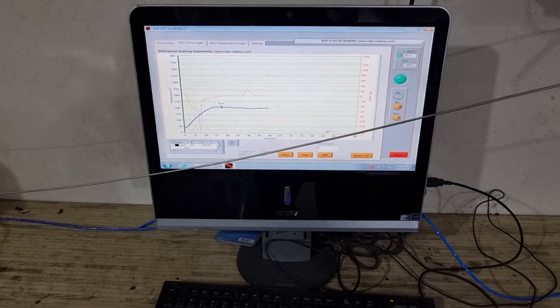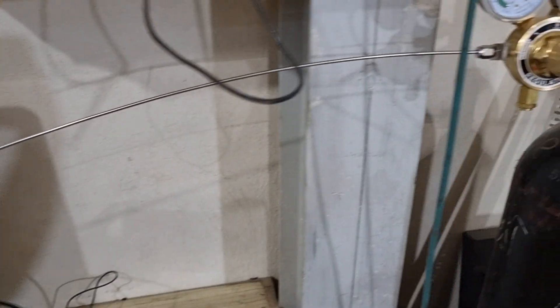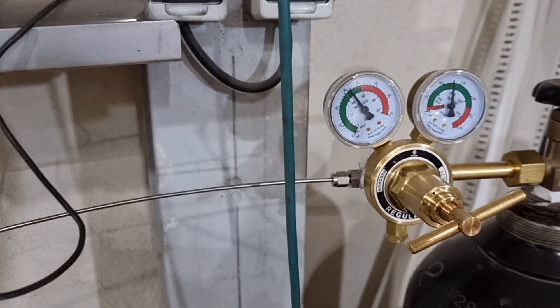You can see the graph here, and the oxygen pressure is reading about 34 bar.